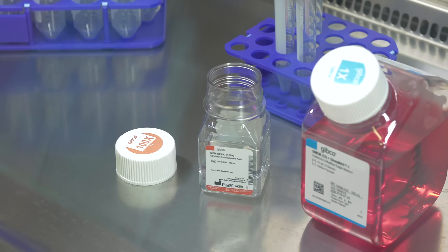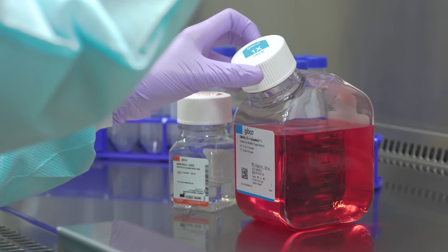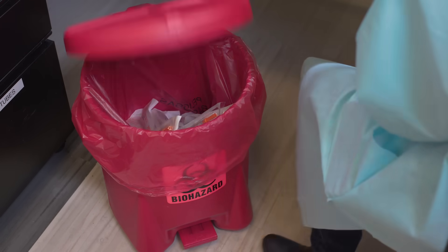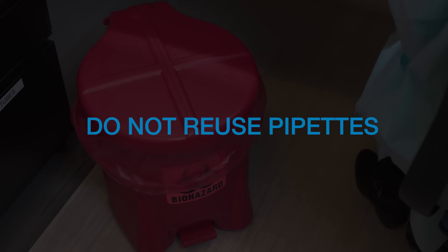When pipetting, try not to touch the pipette to anything non-sterile, particularly the outside of containers, or contamination could result. Each pipette should be used one time and discarded, or washed if using glass pipettes. Reusing pipettes by dipping directly into another media bottle or by leaving it standing in a media bottle increases your chances of spreading contamination.